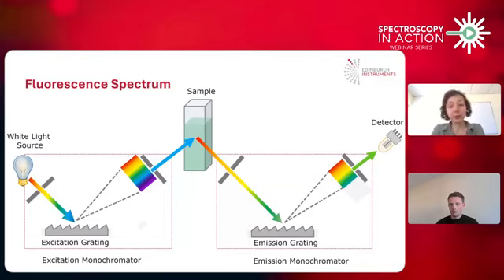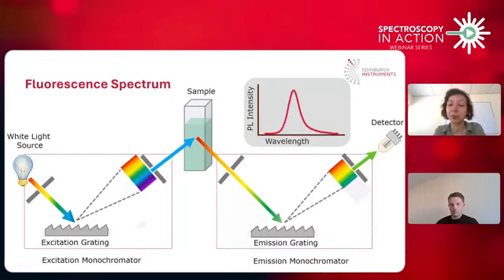So now we have the absorption spectrum of the quantum dots. We want to characterize their emission spectrum. This measurement is going to employ, again, the xenon lamp. And in this case, we're going to fix the excitation monochromator at one wavelength. As Tommy said, it's going to be between 450 and 500 nanometers. And then we scan the emission monochromator to record the intensity at each wavelength of emission. And this is going to generate a fluorescence spectrum, as shown here, intensity against wavelength.